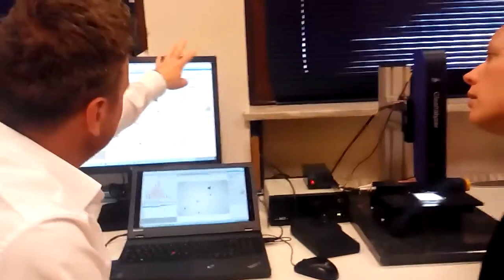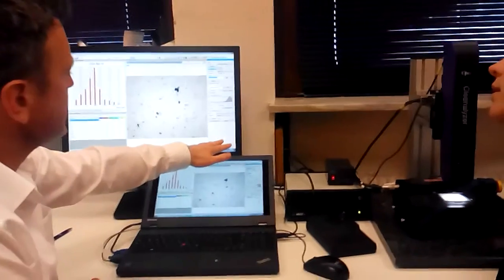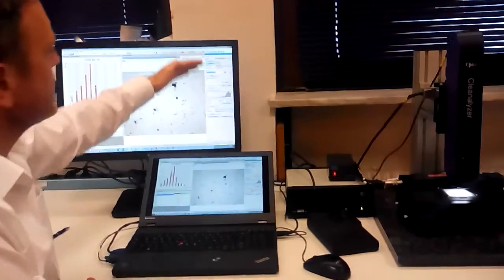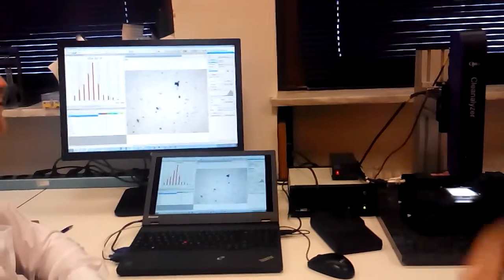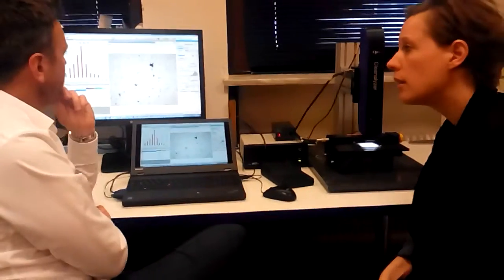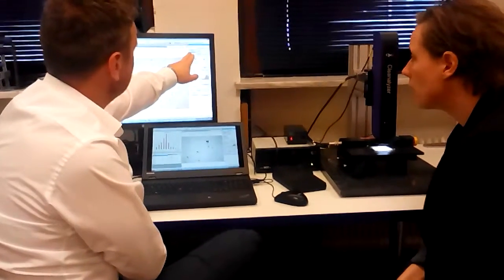Because we have this main control panel over on the right-hand side, and this seems to be in a chronological order of what to do next. We can work from the top to the bottom, and that's very good. So we've connected our joystick.